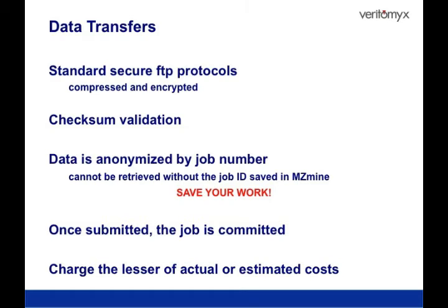Once you hit purchase, the job is committed and you will ultimately be charged the lesser of the actual or estimated costs upon job completion.